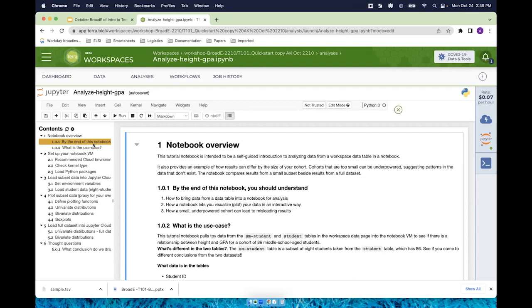And so if I open this notebook in my workspace and I were to share this workspace with another person, and my colleague were to go into the same workspace and open the same notebook, they would not be able to open it in edit mode, because then we would run the risk of overwriting one another. But in order for people to be able to launch computations inside of the notebooks nevertheless, we have implemented this playground mode. So that's what the playground mode does.